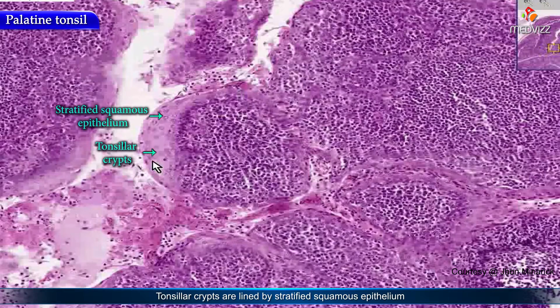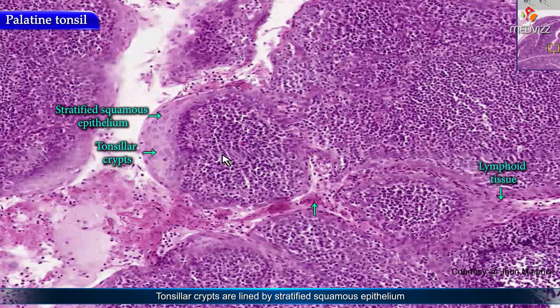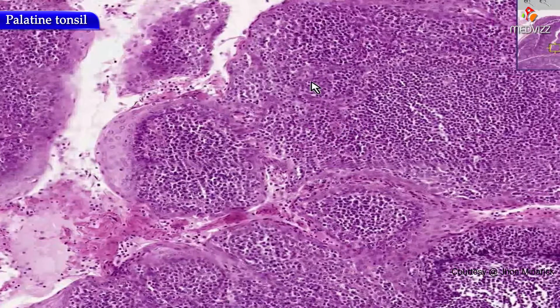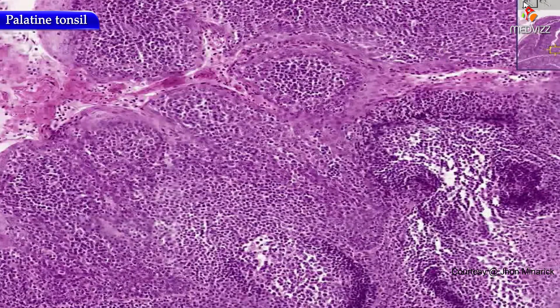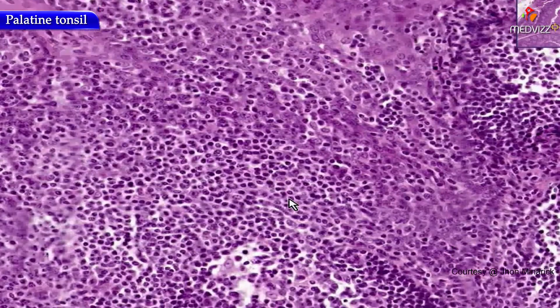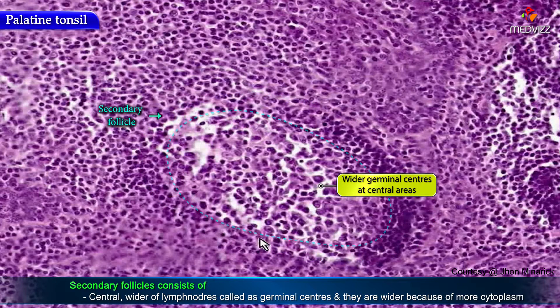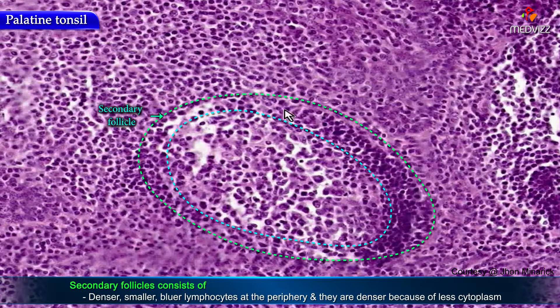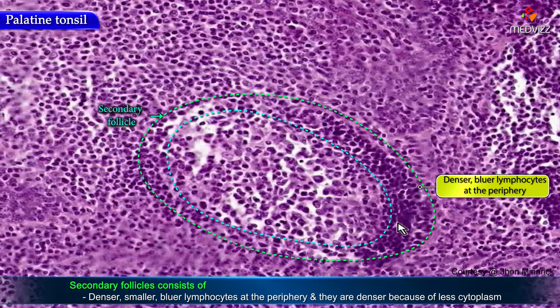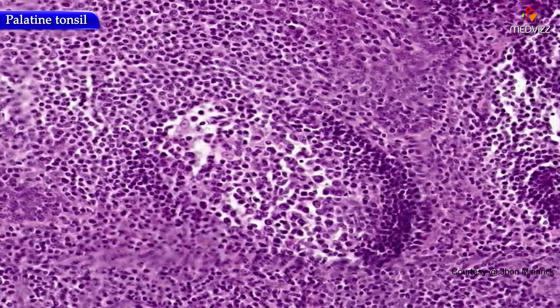The tonsillar crypts are lined by stratified squamous epithelium, as you see here, and they can even extend deep within the lymphoid tissue. The general overall pattern for any lymphoid organ is to have secondary follicles consisting of lighter groups of lymphocytes in the center of the follicle — the germinal centers — which are lighter because there's more cytoplasm per cell, and at the periphery, the denser, smaller, bluer lymphocytes, mostly because the amount of cytoplasm is less. This is characteristic of practically all lymphoid and tonsillar tissue.